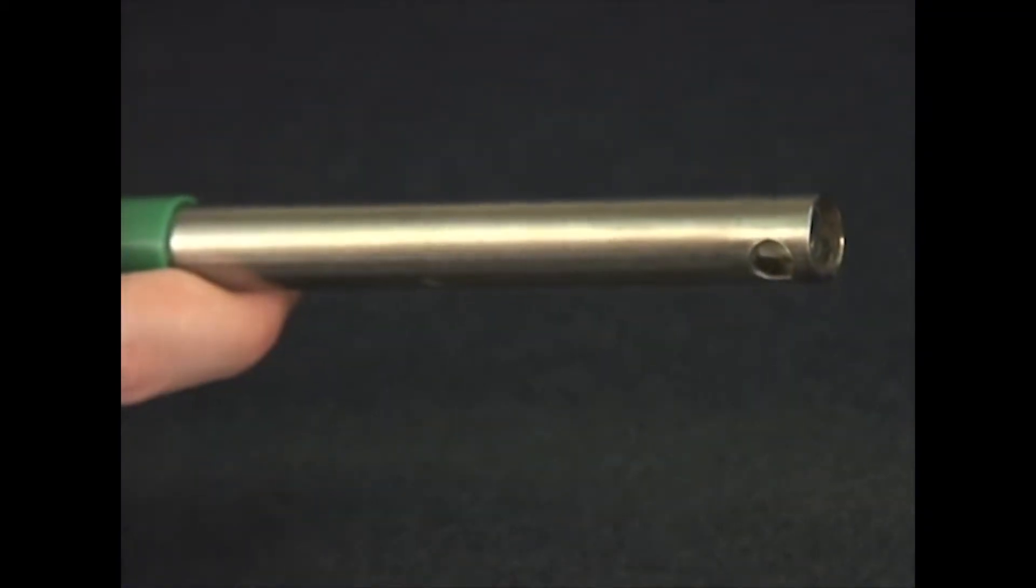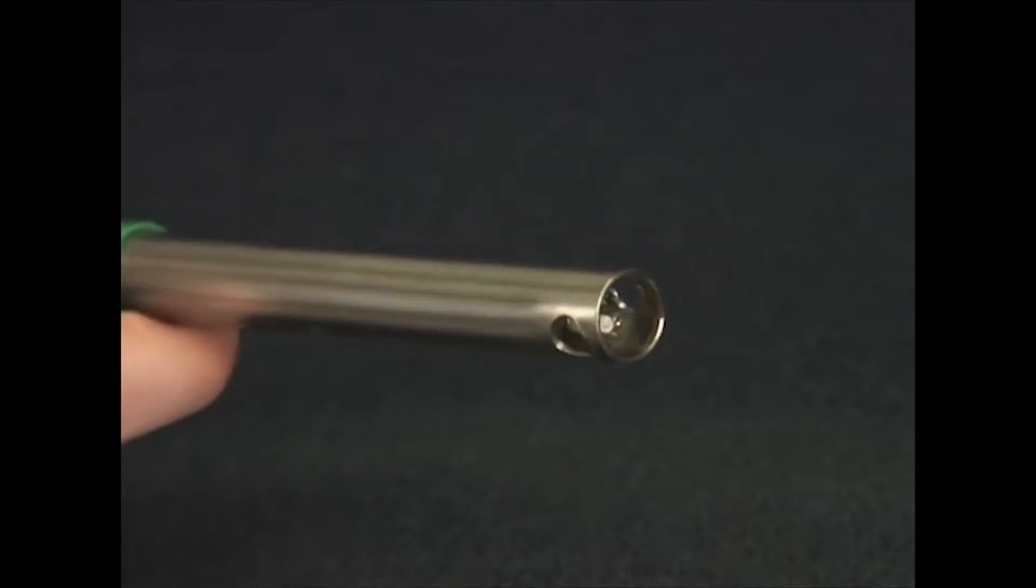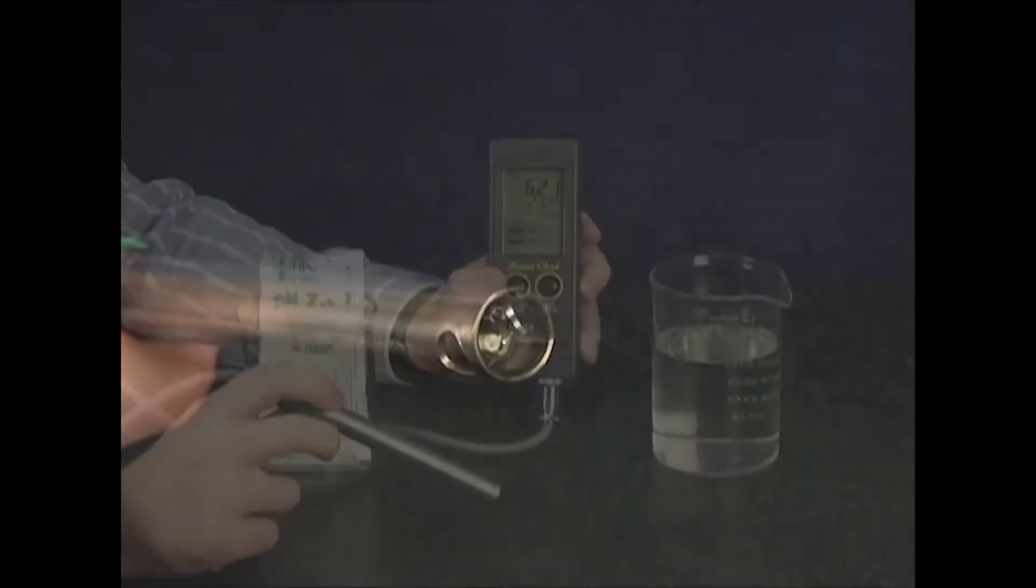The titanium pH probe features a recessed flat tip that is easy to clean and prevent solids and solutions from collecting on the sensor.